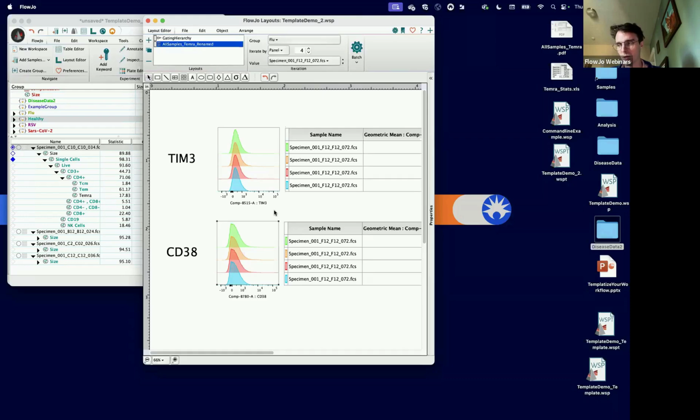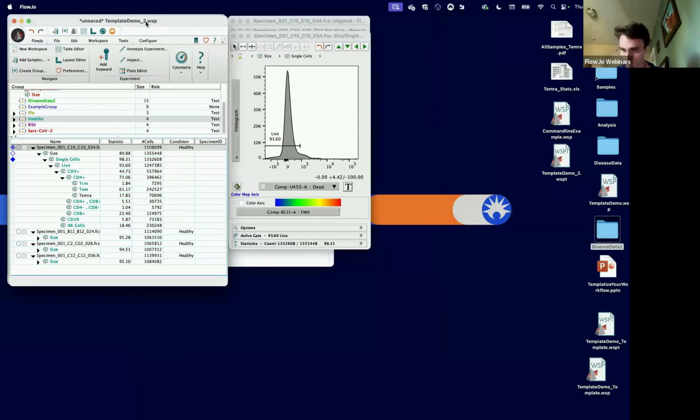And so there's not a lot of cases where it would make sense to have a plugin and then apply it automatically in a template. In most cases, it's easier just to not include the plugin at all in the template and then just rerun.